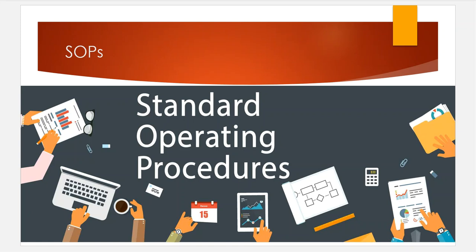We're going to turn away from the methods, and now we're going to look at SOPs and some of the regulations that fall within the SOP category. What to watch out for, why we have to give them to you, why you should have them, why you should follow them. So that's what we're doing next.